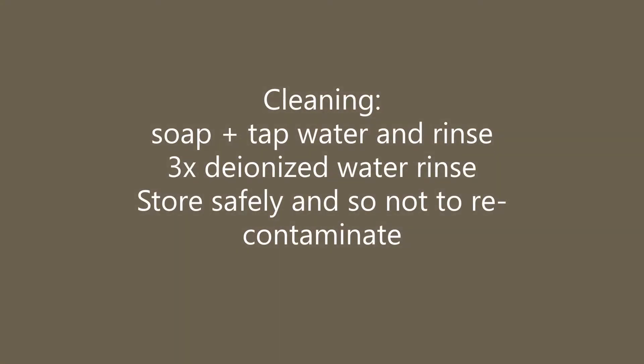The first step of any titration is to properly clean all the glassware needed for the experiment. Wash everything with soap and water, and then rinse three times with deionized water, ensuring that the deionized water rinse touches all surfaces of the glassware. Store the glassware safely until it is needed.